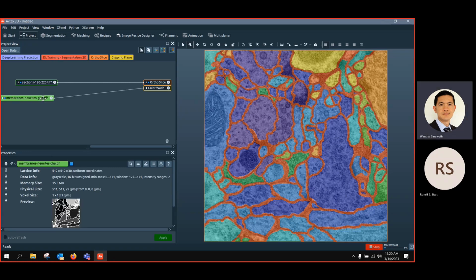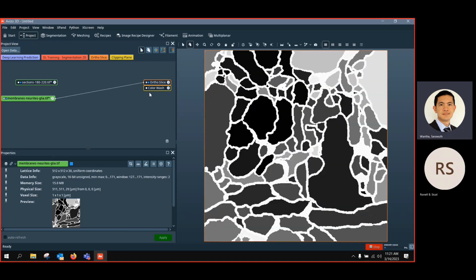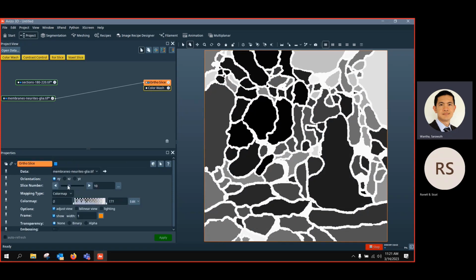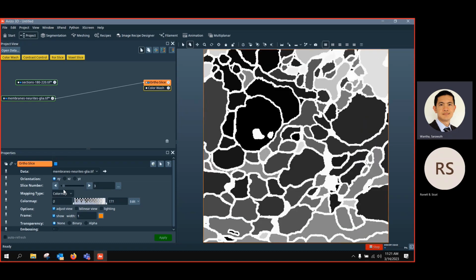So for the first time, we're going to do training just to predict the membrane. To do that, I need to extract this membrane part from this ground truth image. For your information, this ground truth image has been segmented manually. I am not certain, but they do manual drawing on each slice, so you have to draw it slice by slice and annotate them. It's going to take a while, but this way you can get the most accurate ground truth image.